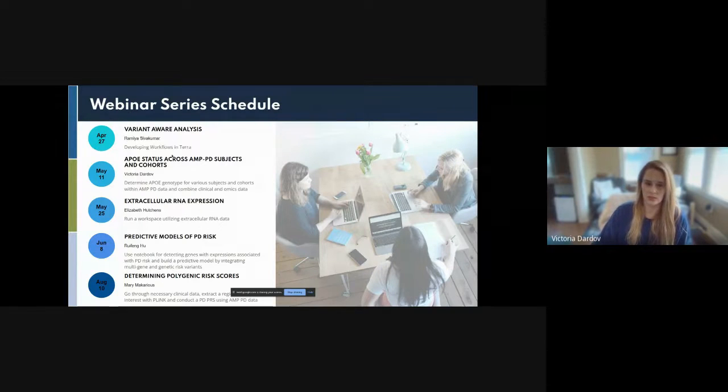So this was today's webinar. We have some upcoming ones that should be pretty interesting. So the next webinar is May 11th, same day and time. And it's going to be focusing on APOE status and looking at APOE status across AMP-PD subjects and cohorts. So we're going to be looking at APOE genotype for various subjects and cohorts within the AMP-PD data and combining clinical and omics data.